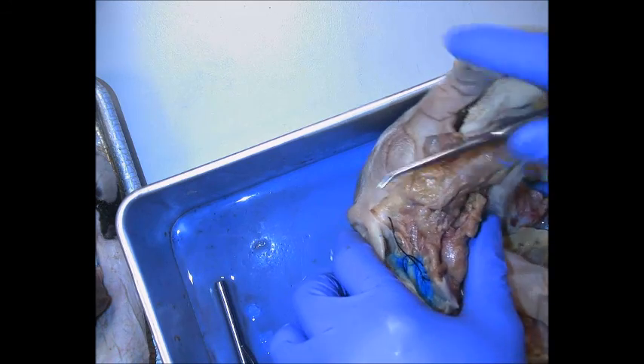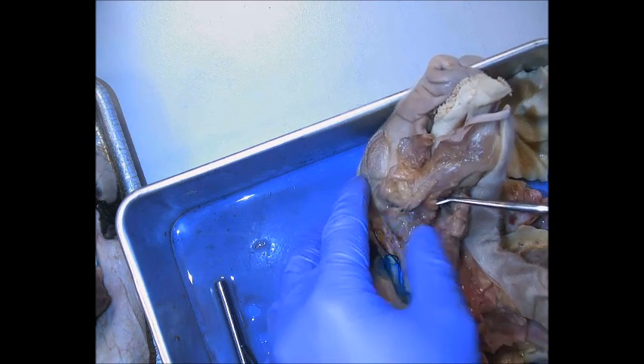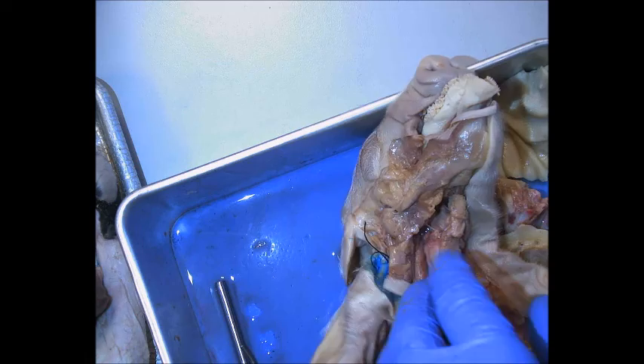On the side of the face, this large gland here would be the parotid gland. What's left of this gland right under the mandible would be the submandibular gland.